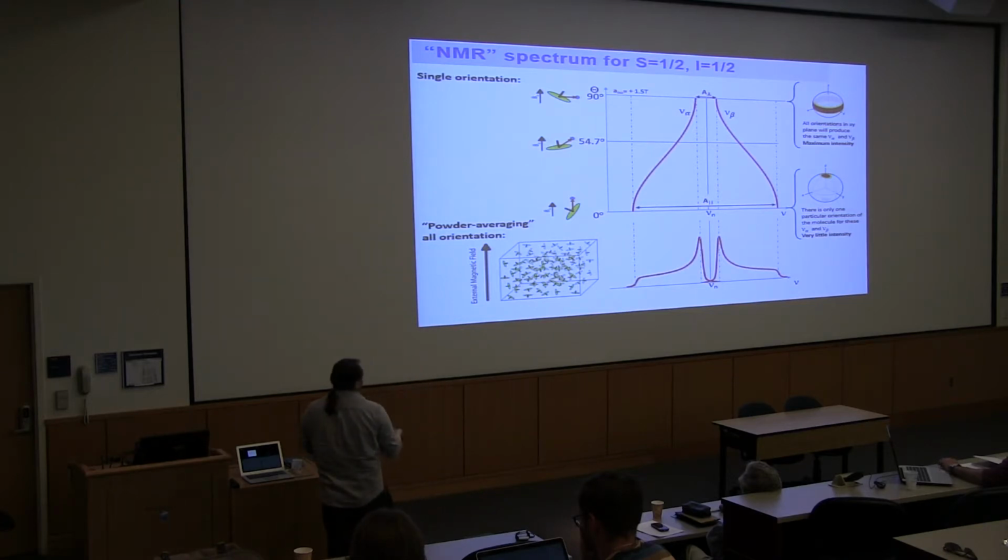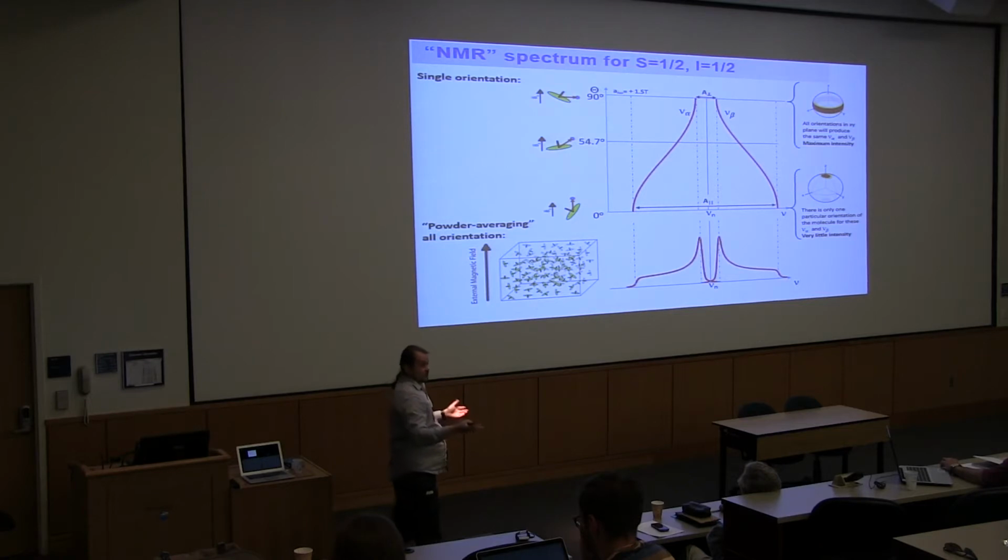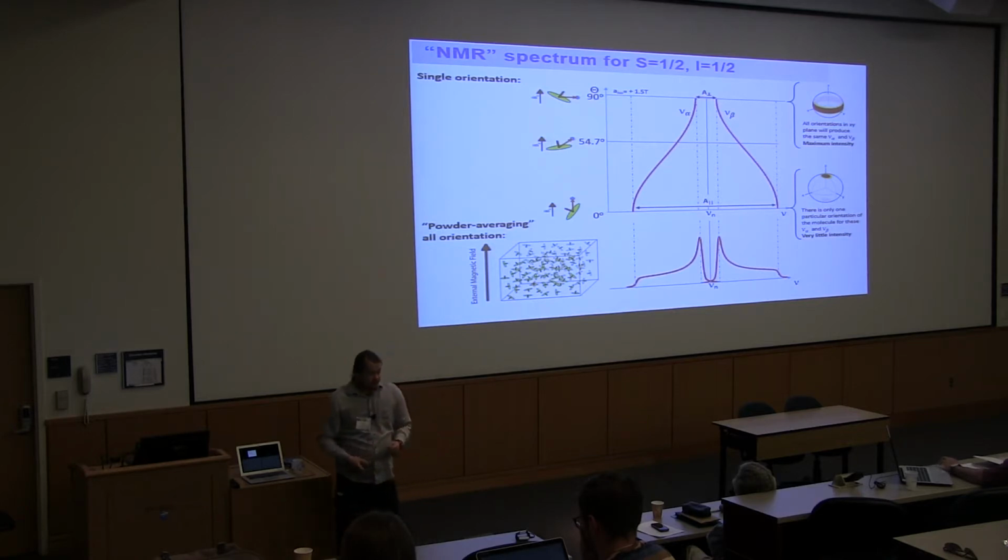And this is how people usually draw things like that. Imagine you have a sphere of all possible orientations of the molecule with respect to the external magnetic field. And then you select on that sphere those molecules that contribute to a certain situation. For example, the ones over here will show you a band on the sphere like that. For a situation where you have the 0 degree, there will be only a little dot on the top there. And the area pretty much tells you the number of molecules in that particular case.